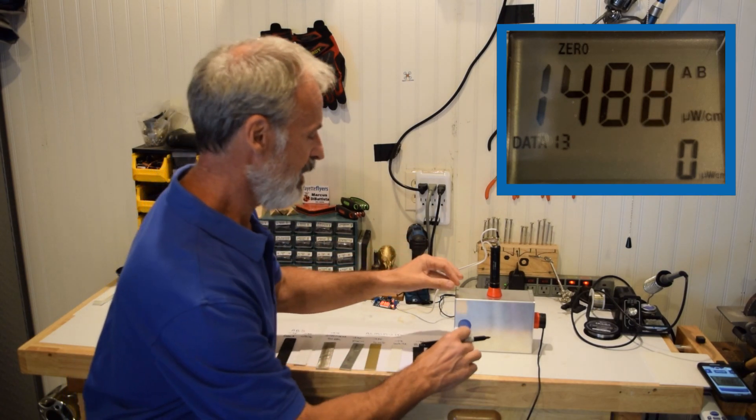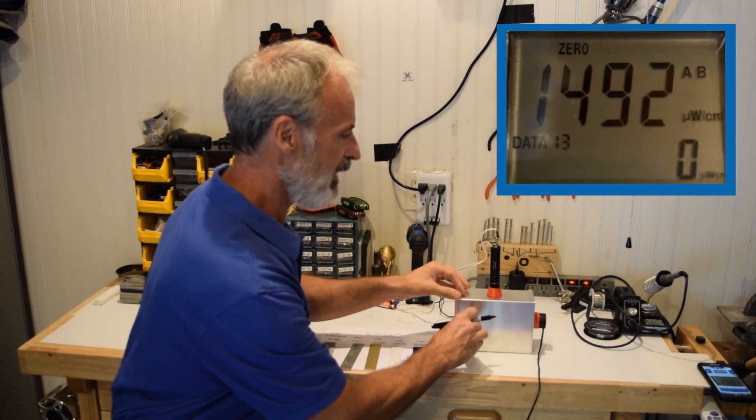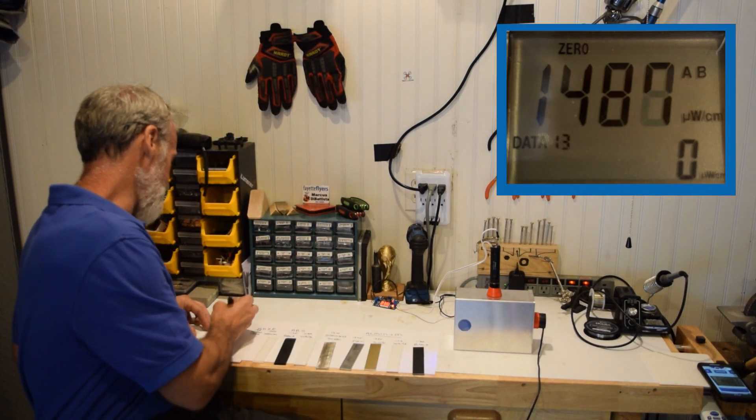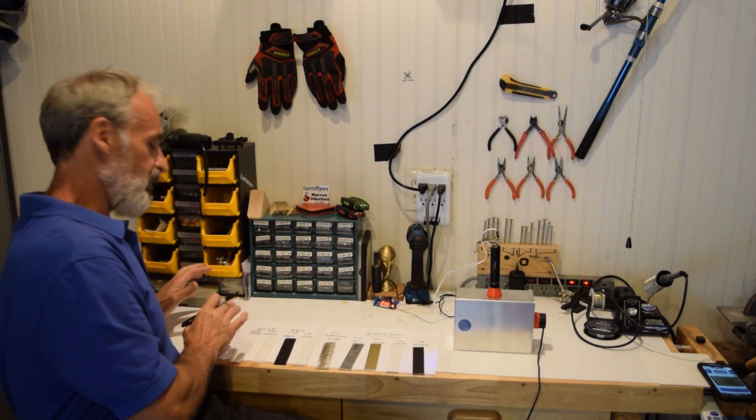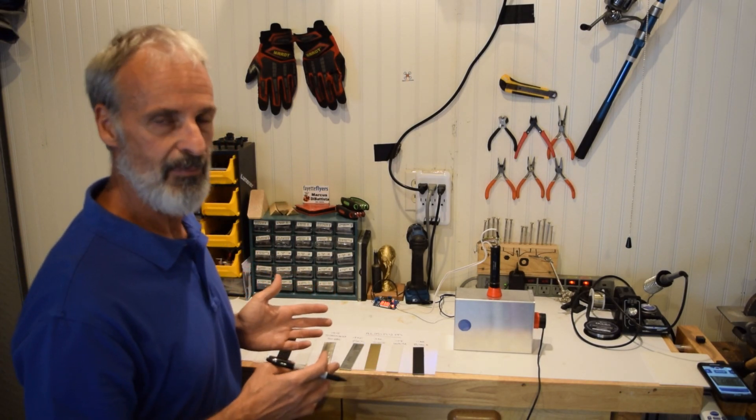And then you take the solid PTFE, which is translucent, which means some light is going through it. Again, almost no change. 1,490. Same. What that tells you is that very, very little energy is absorbed by PTFE, regardless of the form factor.